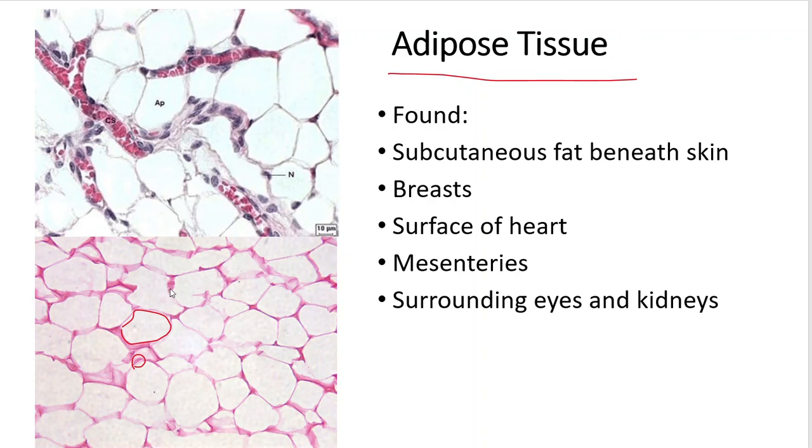If I were you guys, I would take this and compare it to the one that we saw at the back of the epithelial PowerPoint, because they are easy to confuse, and a lot of students do that on the quiz and on the exams, and there's no sense for you missing that. You just need to spend a little bit of extra time.